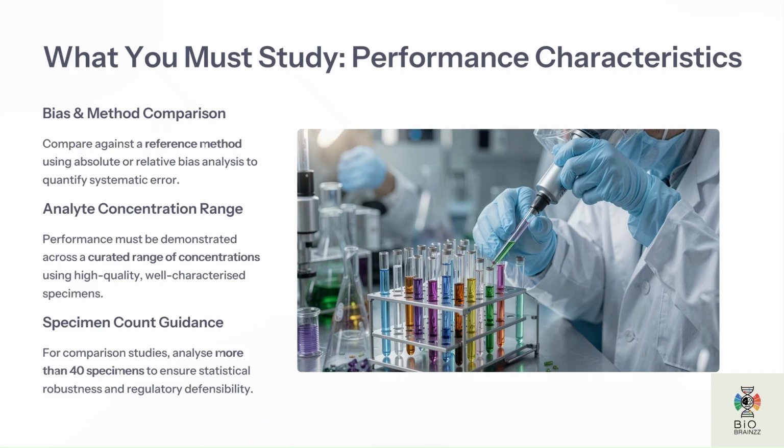Validation studies also require an adequate number of specimens. Using more than 40 specimens for comparison studies improves statistical reliability and strengthens scientific conclusions. Other commonly evaluated characteristics may include accuracy, precision, specificity, linearity, and detection limits. Together, these studies establish confidence in method performance.